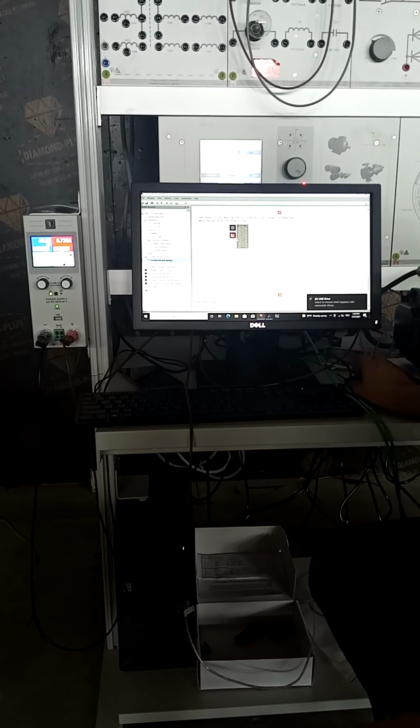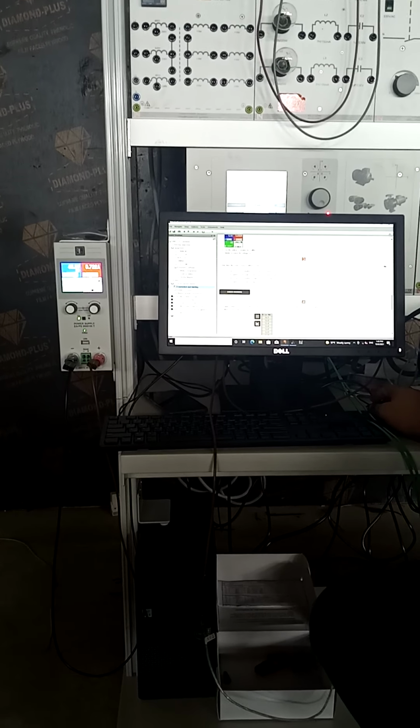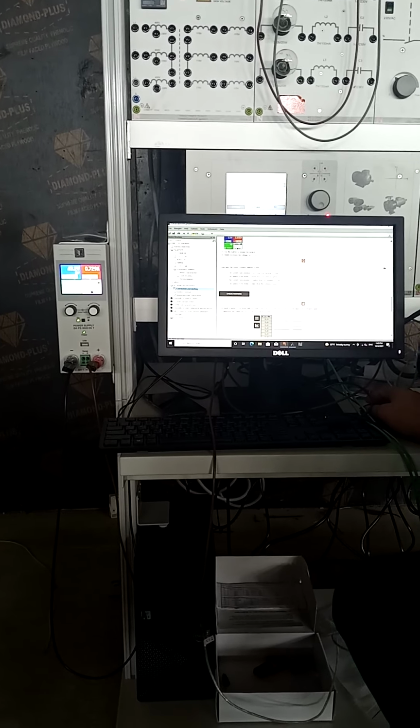That way we need to show you something. In this USB, we have here some questions to answer. If you don't want to answer them, you have solutions. These solutions are here. You can see the option, read solutions.